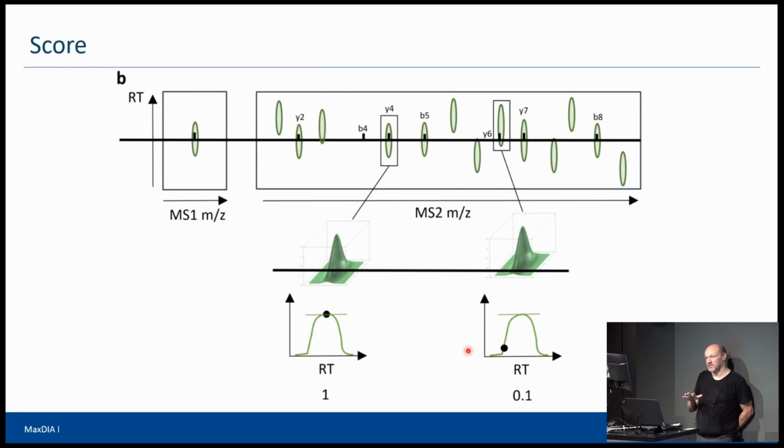You get considerably fewer identifications if you make a restriction like this, right? And I don't think that these are wrong identifications that you get from very short events, because this is all FDR controlled. So I think we can be sure that these are correct identifications. But you have to allow for single scan peptides, that you only see in one scan, and not before and not after. You have to allow for that, otherwise you lose a lot of sensitivity.